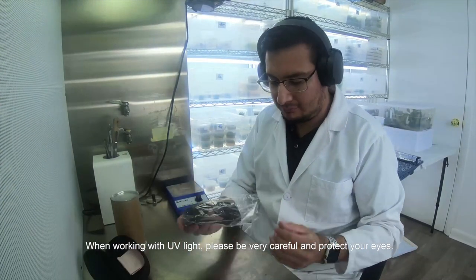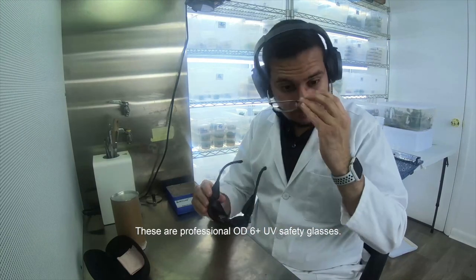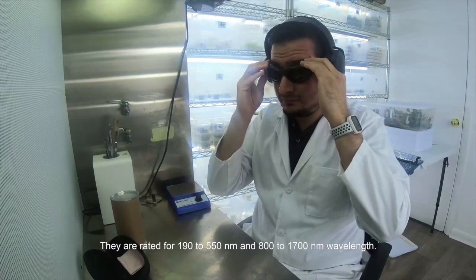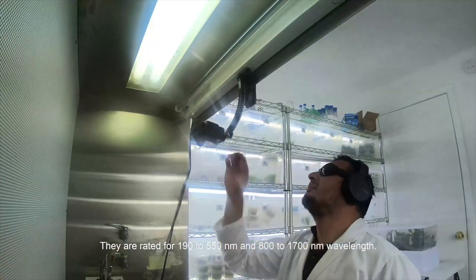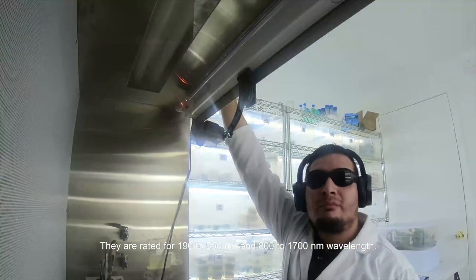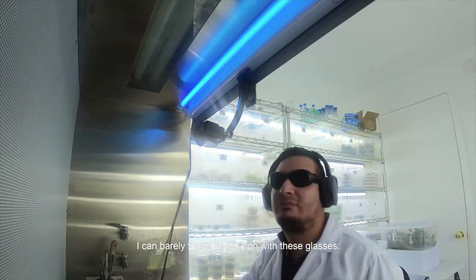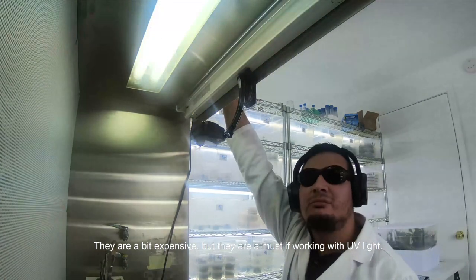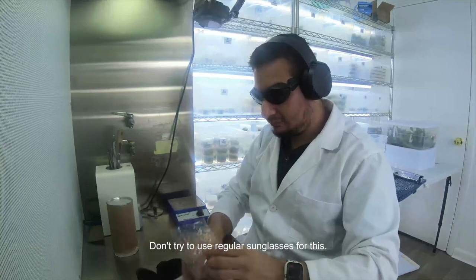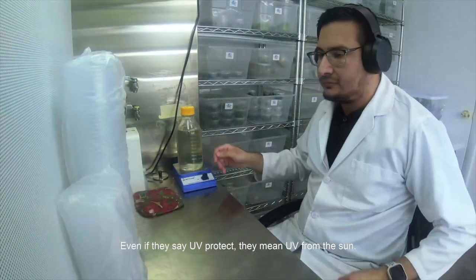When working with UV light, please be very careful and protect your eyes. These are professional OD 6 Plus UV safety glasses, rated for 190 to 550 nanometers and 800 to 1700 nanometers. I can barely tell the light is on with these glasses. They are a bit expensive, but they are a must if working with UV light. Don't try to use regular sunglasses for this — even if they say UV protect, they mean UV from the sun.